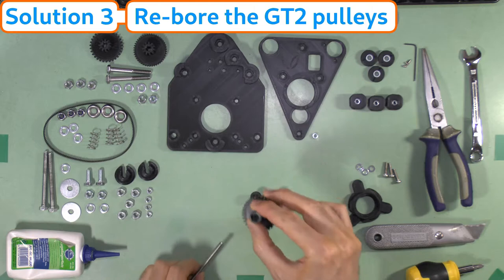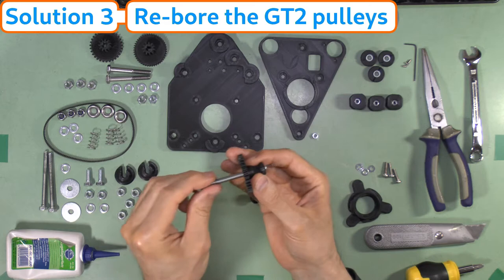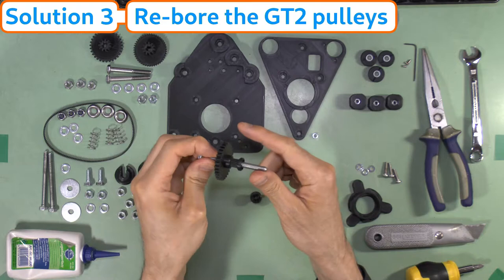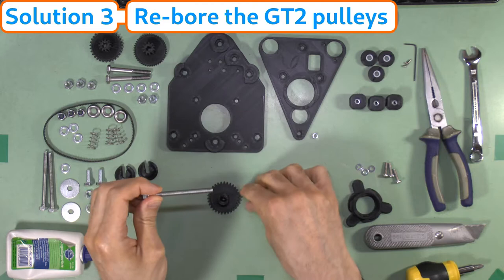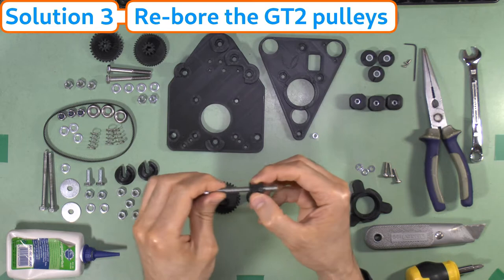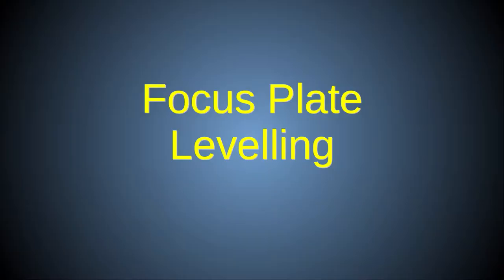If the previous solutions still do not solve the issue of a sticky focus gear, the central axis holes in the focus pulleys and/or gears may not have been sufficiently widened and cleared during construction, and may be clinging to the threads of the focus posts and gear axles. The solution is to dismantle the stage and attempt to further clear the bores using the thread of a focus post bolt as described in the first Z-stage construction video, ensuring they spin freely on the thread prior to reassembling.